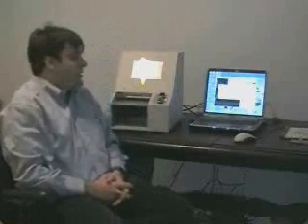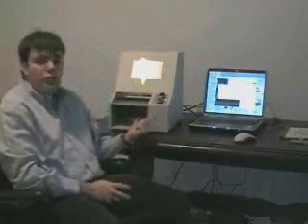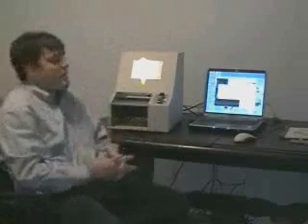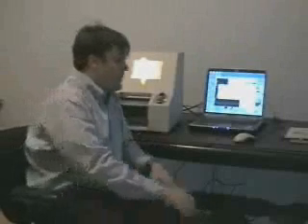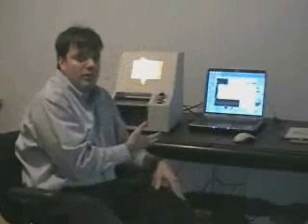What should happen is that the machine should turn on, the motor will turn on, and you will see a red light emanating from inside of the machine. But in this case, of course, that is not happening. That is because the COM port is defaulted to 1 in the software, but your computer may be using a different port as the controller. In this case, if your machine is turned on, then please disregard the next minute of this video. But if nothing is happening to your Pillgrade machine, then please follow these directions.